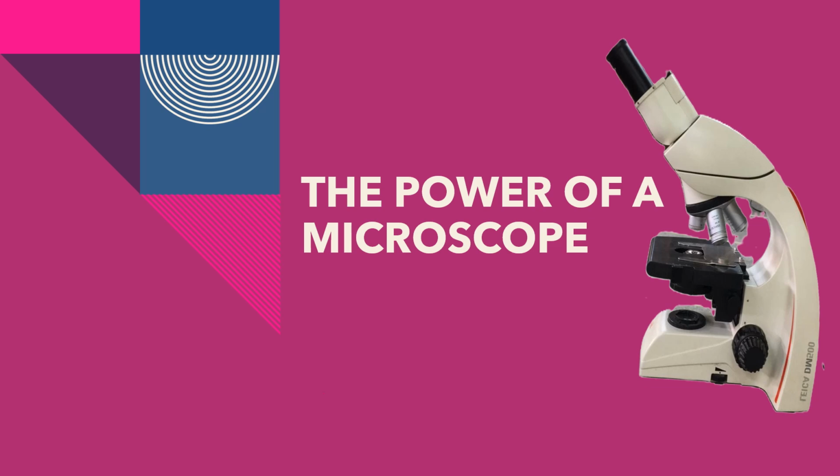In fact, without the microscope, a whole world would have been unknown to us. It is because of this compound microscope that we have been able to discover the world of microorganisms and even know that they exist. Without this microscope, we wouldn't have known that minute life forms existed. Maybe we would have felt they existed, but we wouldn't have had any evidence for them. So that's how powerful the microscope is.